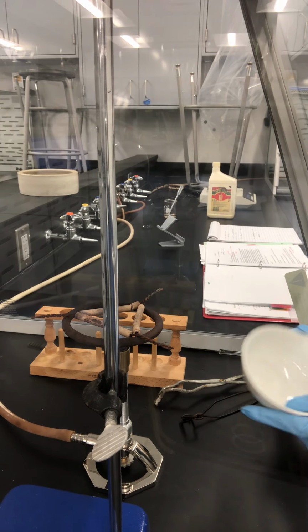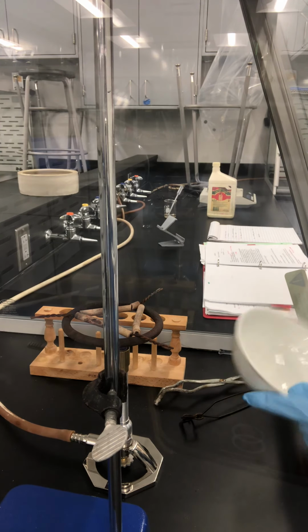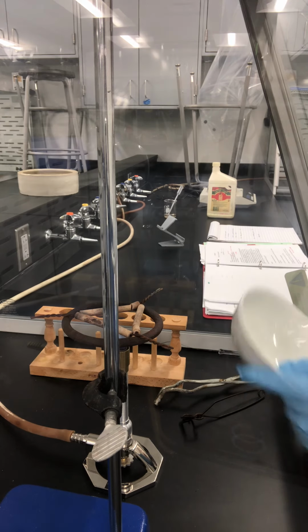Okay, now since I already cooled that down, I need to put it on the balance to measure how many grams this evaporating dish is by itself.